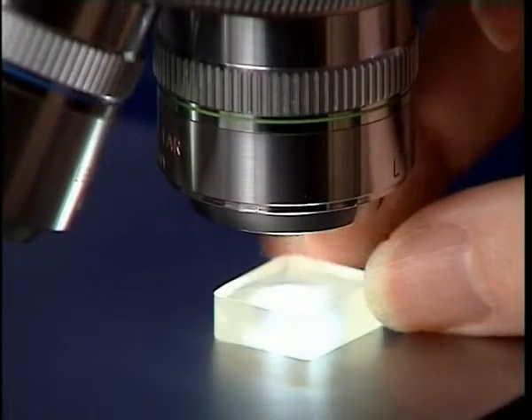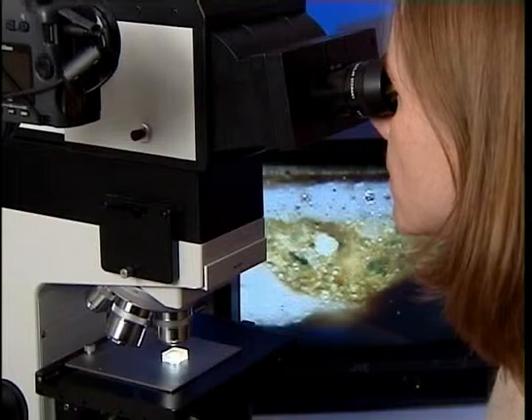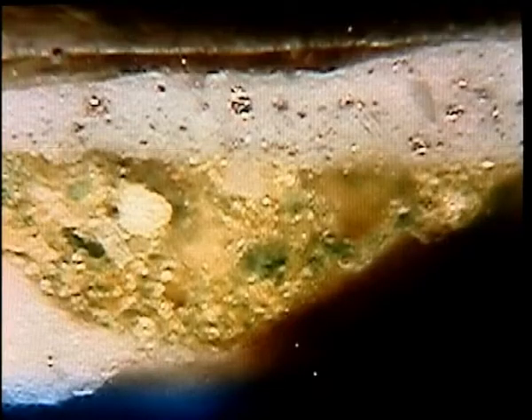Now I'm going to look at the cross-section that I've made under a higher-powered microscope at a magnification of about 200 times in reflected light. And now we can see the layer structure of the paint sample. We can see here that there are three separate paint layers. The first one, the lowest paint layer, is the white priming layer placed on the panel before Raphael started painting. And the uppermost layer is the grey paint of the arch. But what we can see is that the grey paint lies over green landscape paint.